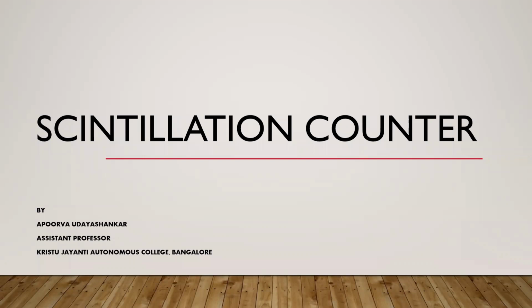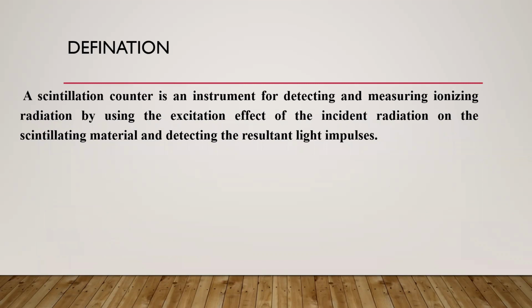Today, let us study about the scintillation counter. A scintillation counter is an instrument that is used for detecting and measuring ionizing radiation by using the excitation effect of the incident radiation on the scintillating material and detecting the resultant light impulses.